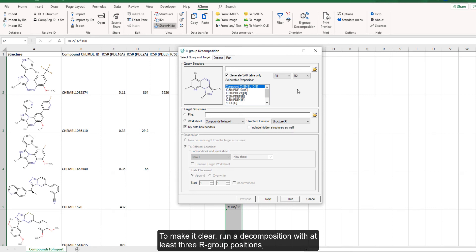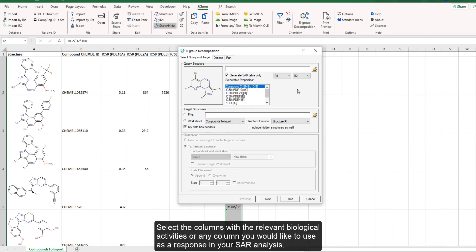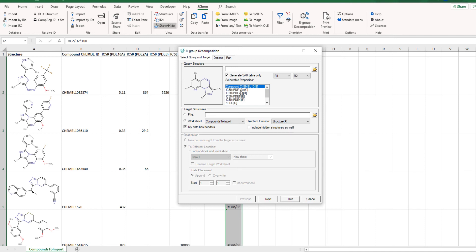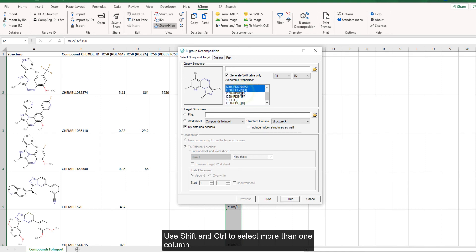To make it clear, run a decomposition with at least three R group positions and inspect the formula behind one of the values on the resulting worksheet. Select the columns with the relevant biological activities, or any column you would like to use as a response in your SAR analysis. Use shift and control to select more than one column.